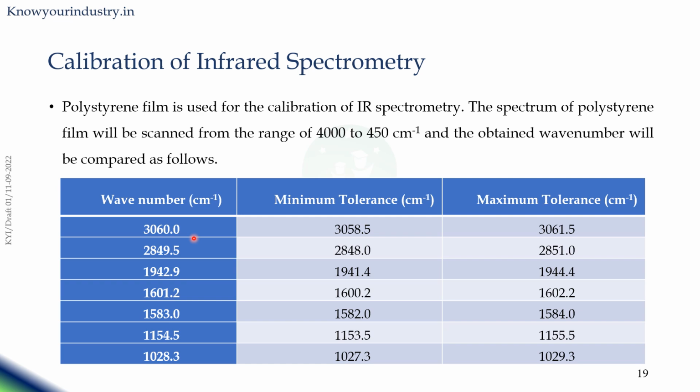The wave numbers for polystyrene film are already established, and what is obtained should be within the minimum and maximum tolerance limits.